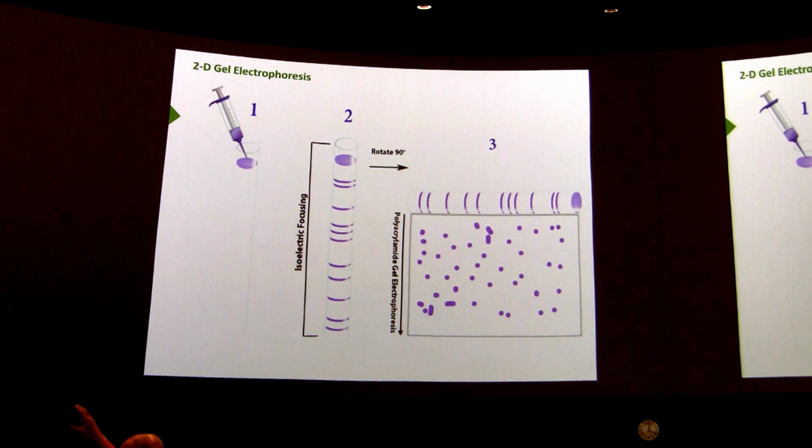Question, yes? So I treat, say it again. That's correct. And whenever I run SDS-PAGE, I've always got SDS in the gel as well. Yeah. So there's plenty of SDS there. Remember, we want to have these things coated as much as possible. If the gel didn't have that, then it would just come off, and I would see some unusual things.